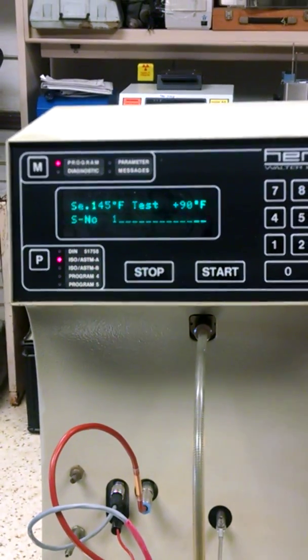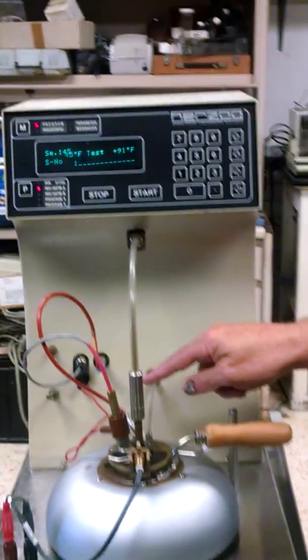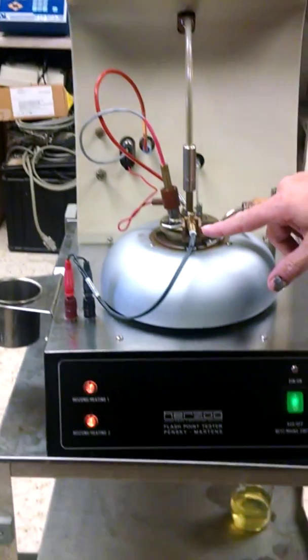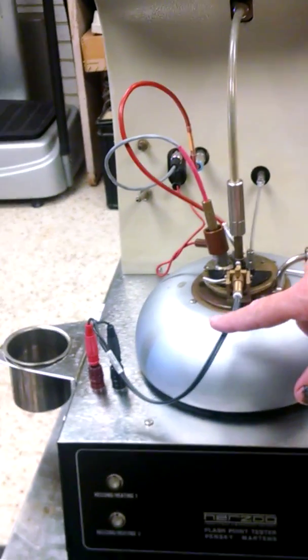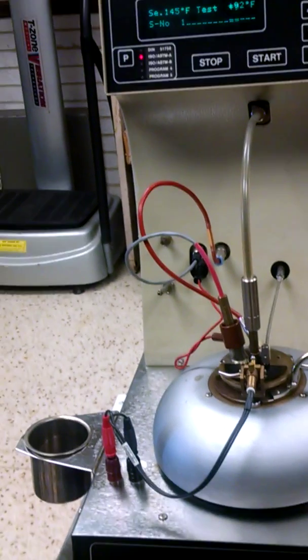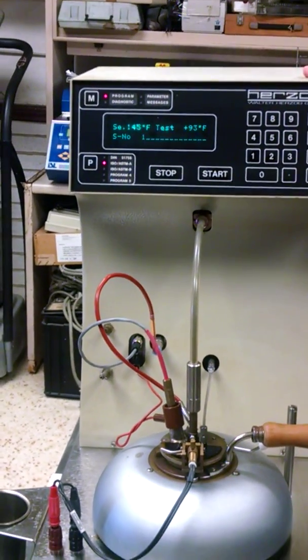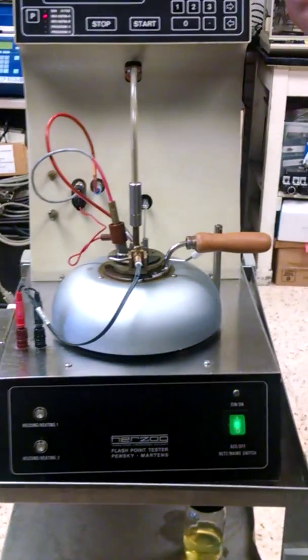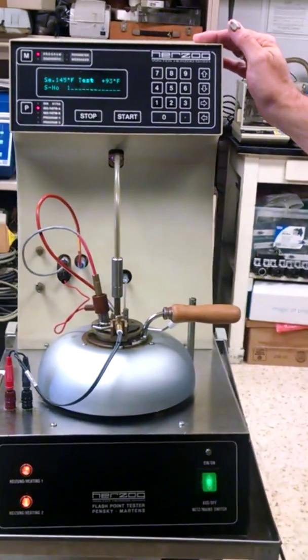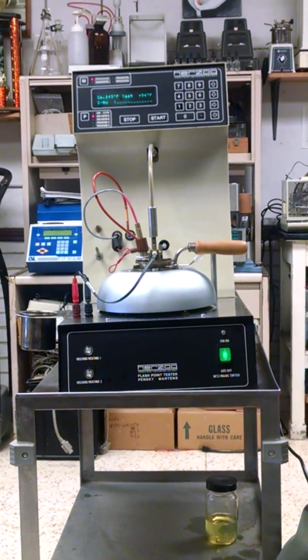And the thing about this machine is we also have parts. We have extra arms, we have extra flash mechanisms, we have extra cups, we have extra electronics. So even though this is an older machine, you can come to us for parts. If you buy it, it breaks down, we can either fix it or we can supply you the parts so that you can fix it.